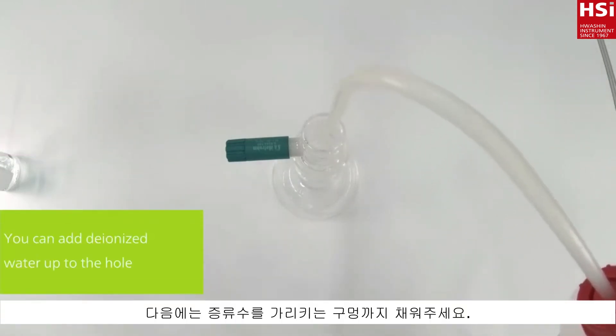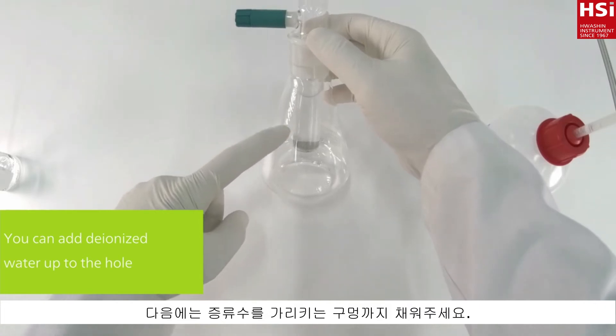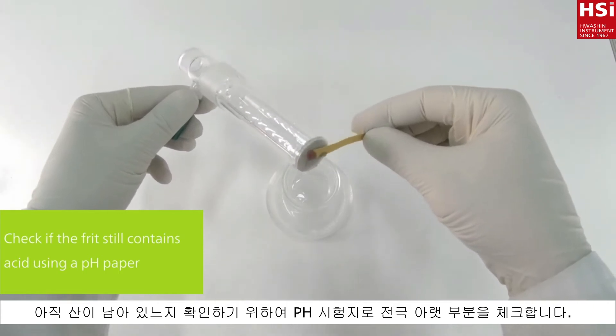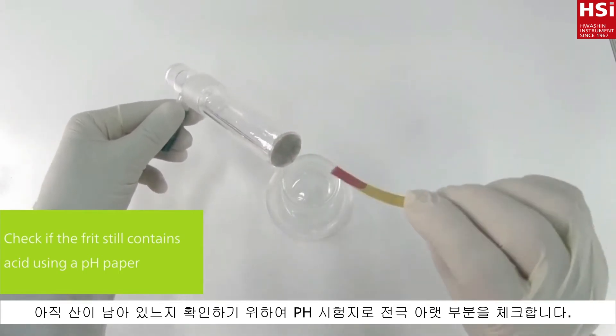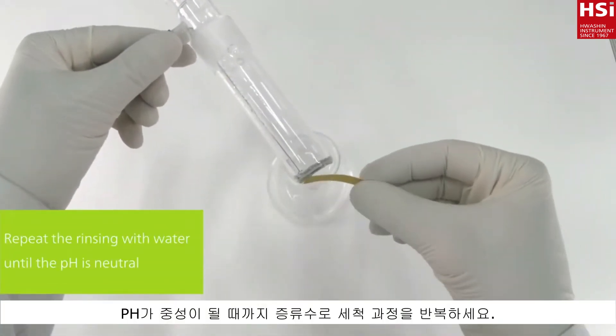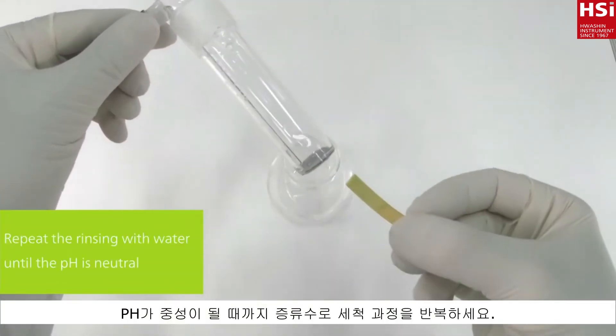In this step you can fill up the generator electrode to the hole. Check if all acid was rinsed out by holding a pH paper to the bottom of the electrode. Repeat the rinsing with water until the pH is neutral.